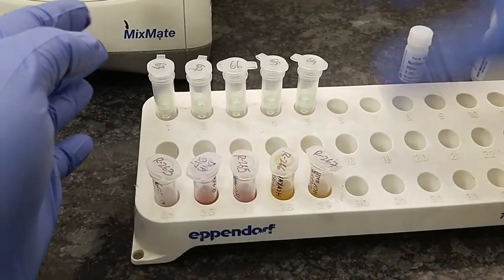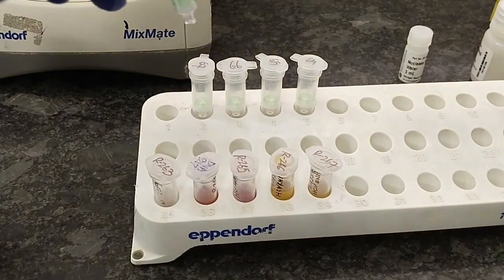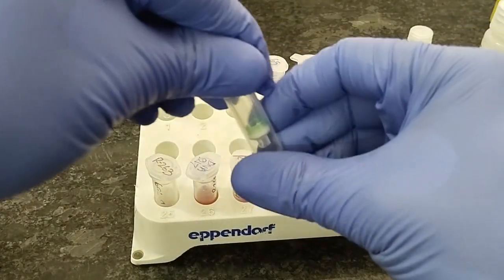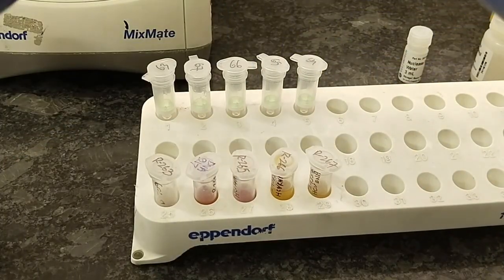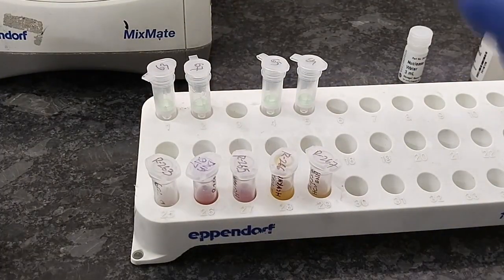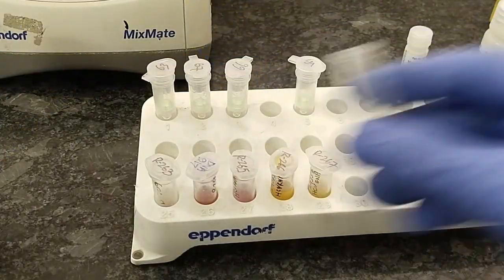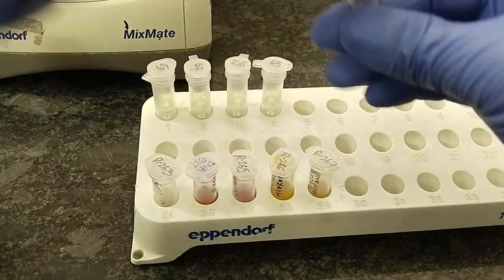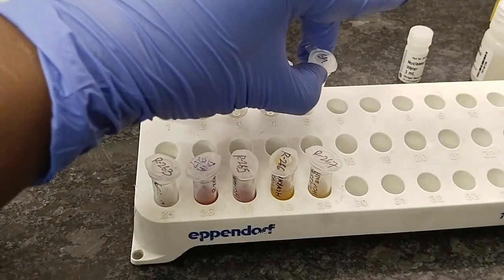In the washing step, we have done centrifugation for the second time, and it is the last step of washing. Now just discard the flow through from the collection tube. I am discarding the flow through from the collection tube and preparing the tube for the dry spin.